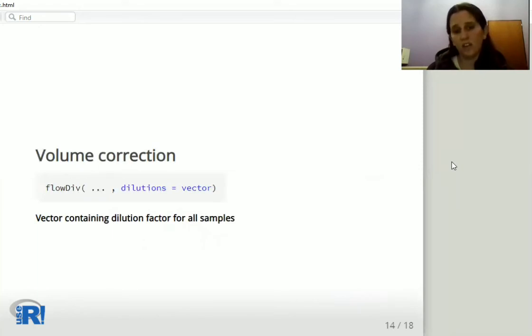The dilution argument activates the volume correction step. Here the input is a vector containing the dilution factor for all samples.